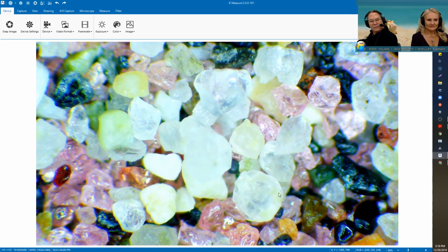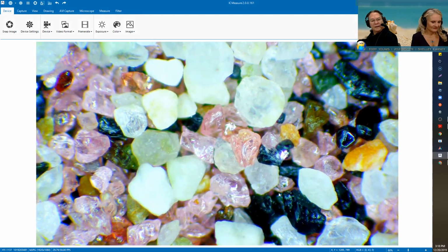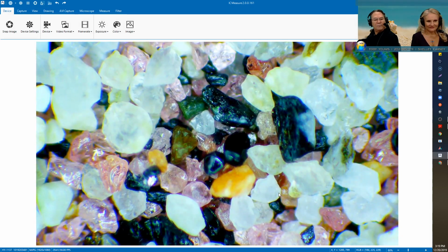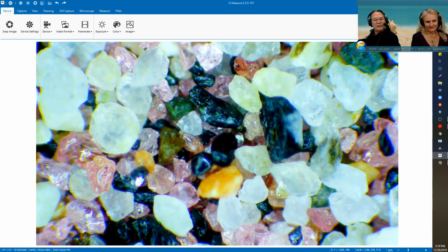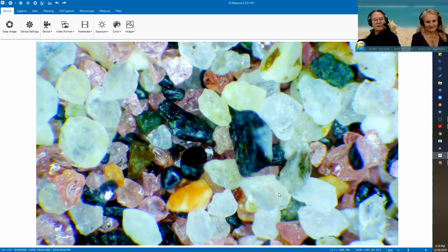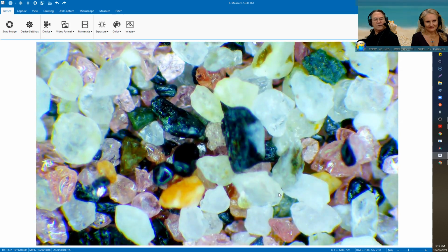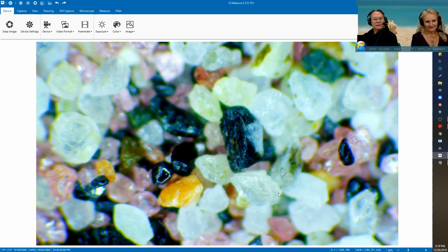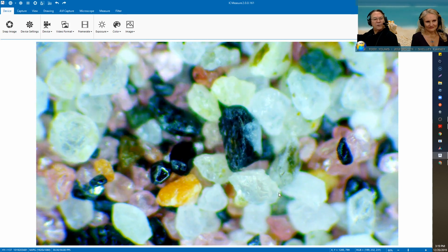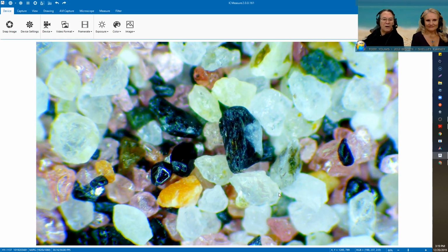These down here, I'm going to push up just a little bit. And to me, those pieces in the center there look like shiny black, very obsidian looking. And we do have some of the compound stuff, the ones that look like igneous rock, like this one here. You can tell it's got a lot of minerals as you just kind of focus through it. It's almost like the igneous rocks that we saw out of last Wednesday's sample at the John Day River.